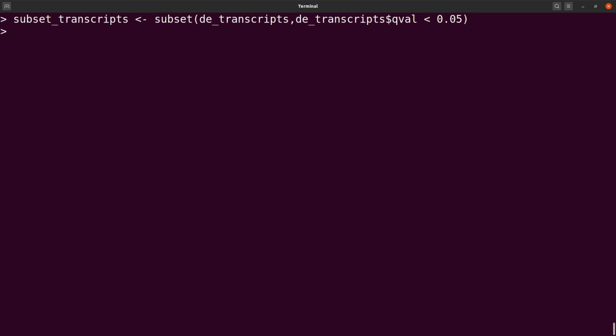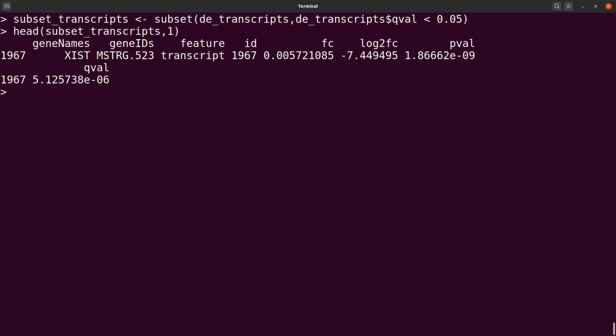Perfect, it's done. So again, you can just say head subsets, let's say 2 or 1. Let's just say 1 to get it then. And then you have it done. Okay, so that's it. Let's also do the same for the genes.